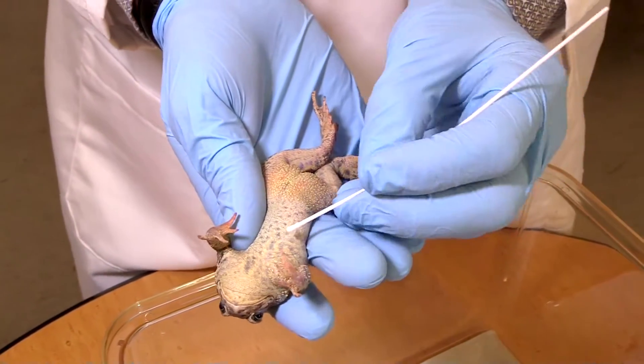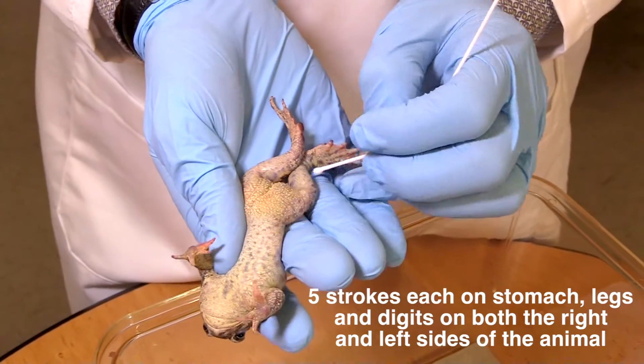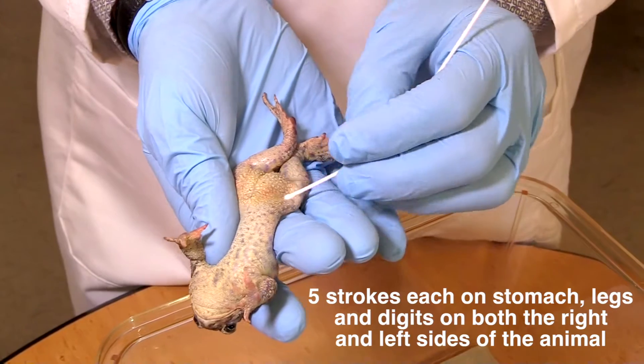So I'm going to do 30 strokes. The way I do it is I split it up into fives — one, two, three, four, five, one, two, three, four, five. So that's ten.